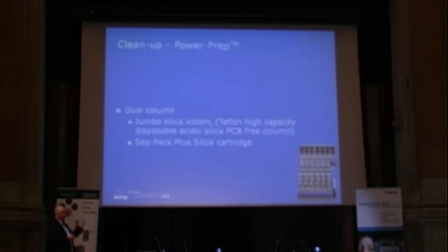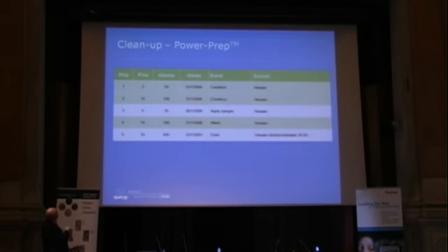Here are some results. All kinds of samples we have been analyzing in the last month. And one of the samples, and we are going to focus our study on that, is a sample of eggs, which is highly contaminated with HBCD. We don't know what the origin is of this egg sample, but we are working on that. It's really, really high.